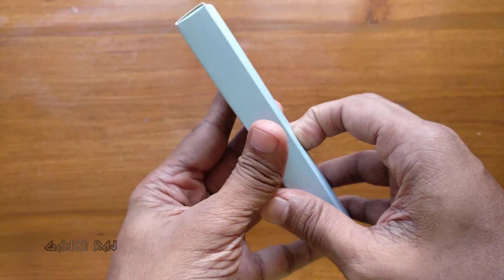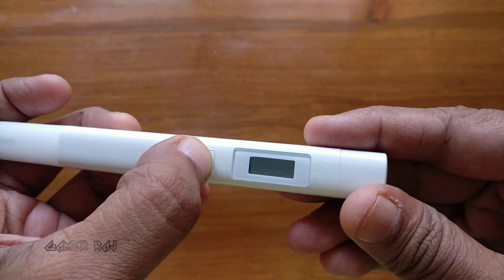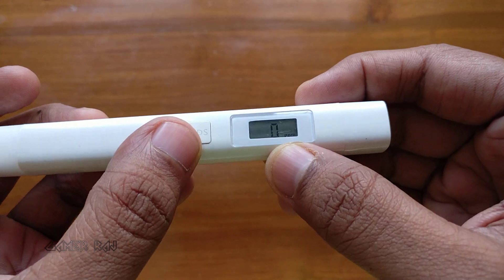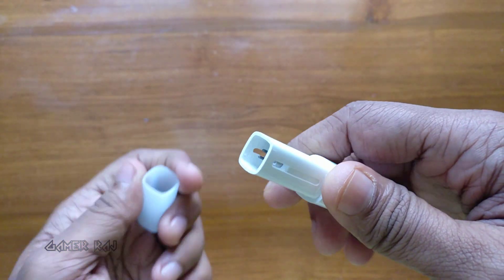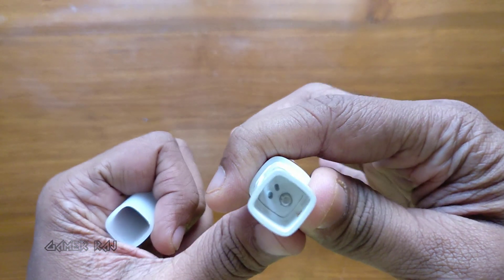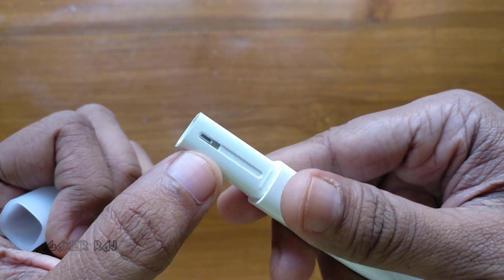Here is the tester: the on/off button, display, cap, and corrosion resistant titanium probes. Be gentle with the probes — bending them will affect the readings.